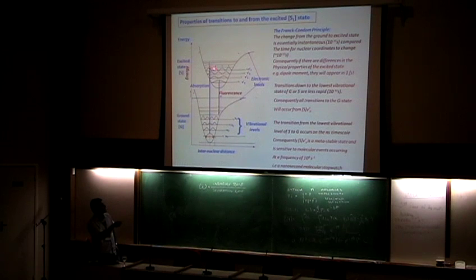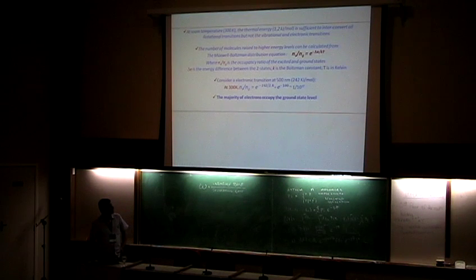And then you have some vibrational relaxation that occurs in around 10 to the minus 12 seconds. And the fluorescent emission has a whole time of the universe for this molecular fluctuation to occur, so that's why it can probe a lot of the changes in biology, tumbling of molecules, energy transfer, etc.